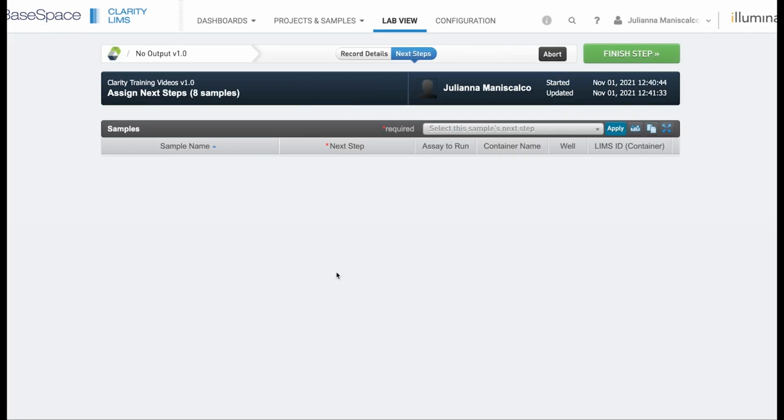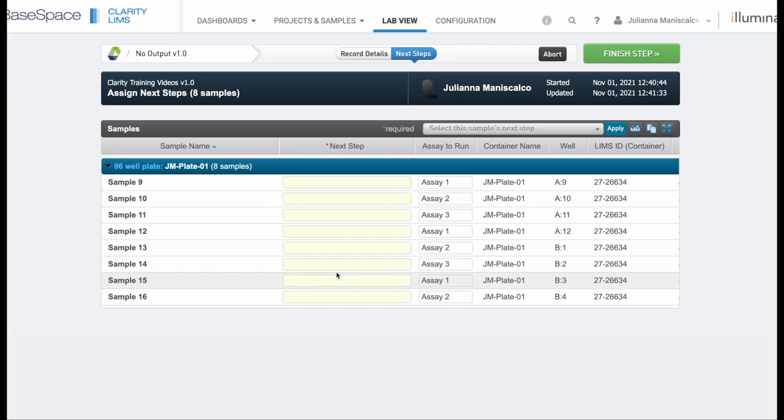Now I think that this may be the most important part to this video. I'm going to repeat this step, meaning that these same 8 samples will rerun through the no output step. What will happen is, since we set the derived sample field on the input sample, because these samples were not plated and no derived sample was made, when we rerun these samples, the assay to run field will already be populated.